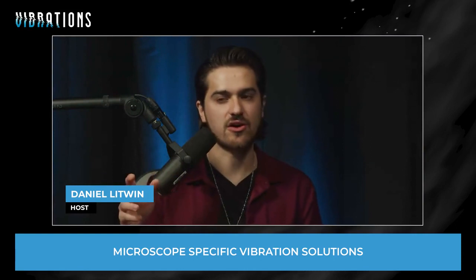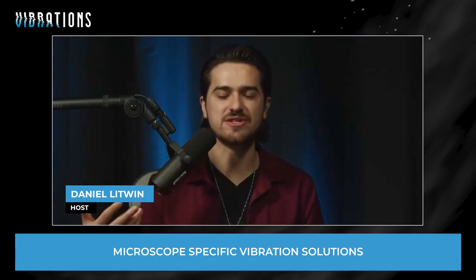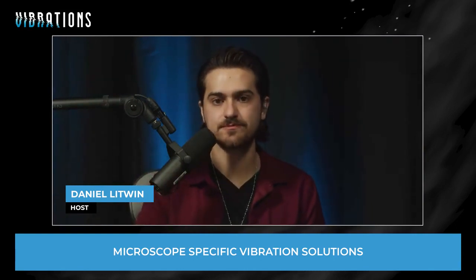What else is typically influencing that decision? Yeah, great question. I've been lucky enough to visit microscopy labs all over the world, and there's a lot of diversity. But anybody who's been to a decent number of these labs is going to realize a lot of them are in basements or sub basements, or they're in very small rooms that were specifically designed for that instrument. So, ease of installation is critical.